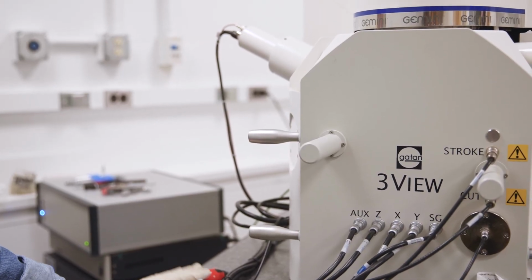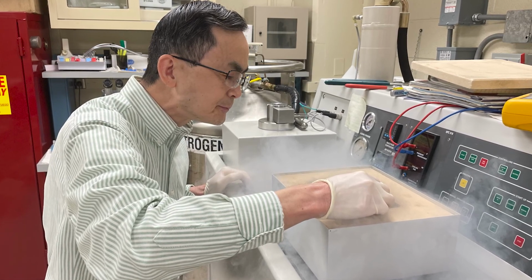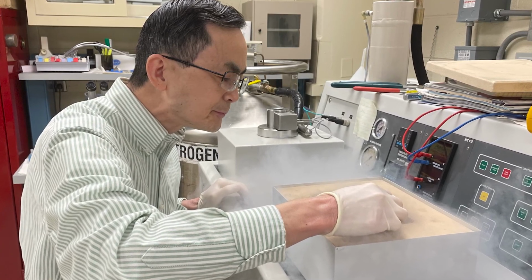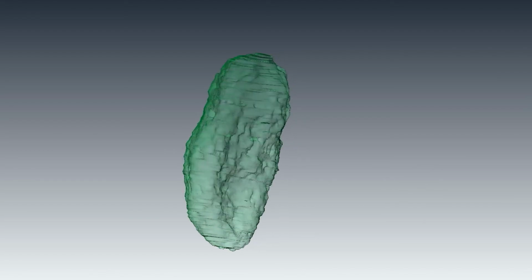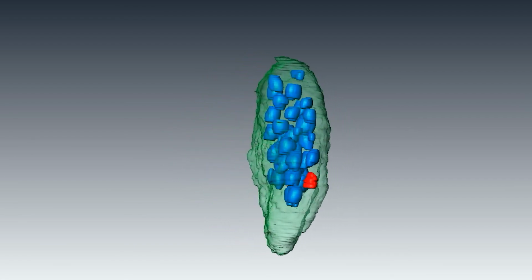The 3D electron microscope in our lab relies on using fixatives together with heavy metals to stain cells and tissues that are embedded in plastic. Sometimes we also use high-pressure freezing methods to preserve the ultrastructure for high-resolution studies. We've been working recently on platelets, and in doing this, we have a joint collaboration with Richard Liepman's lab at the NIH.